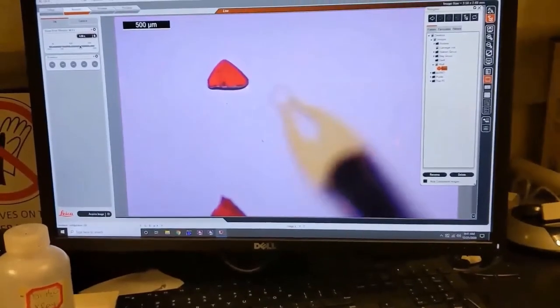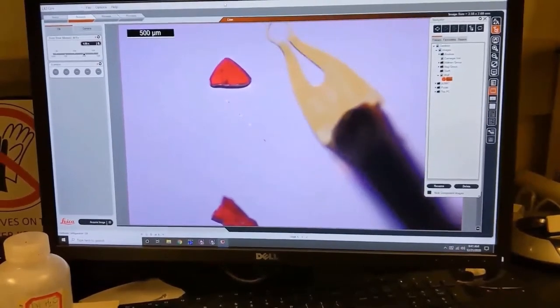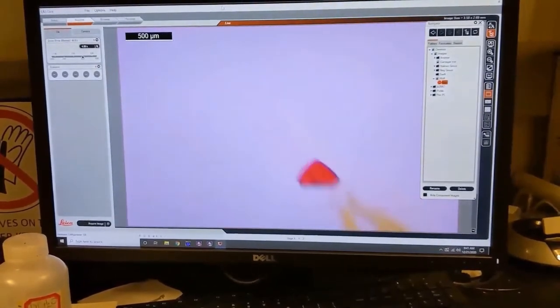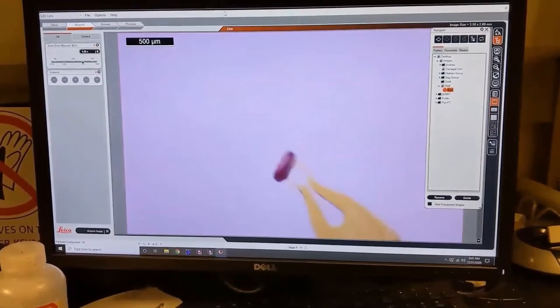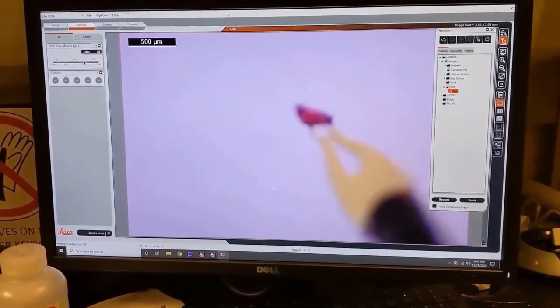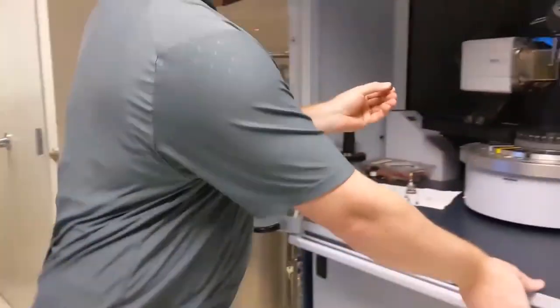Here you can see the shape of the micromount tip. To pick up a crystal, I first make sure it's out of any large pools of oil, and then I try to slide the mount underneath and lift the crystal up. I want the crystal as close to the top of the loop as possible and with the absolute minimum amount of residual oil on it. Once it's on the loop in a good position, quickly get it on the instrument.